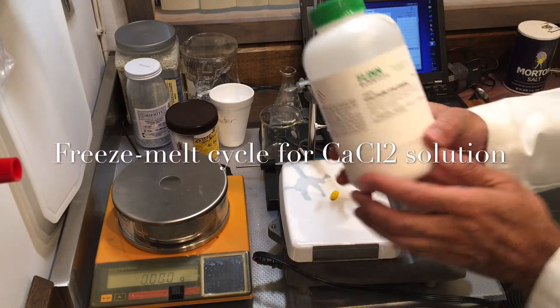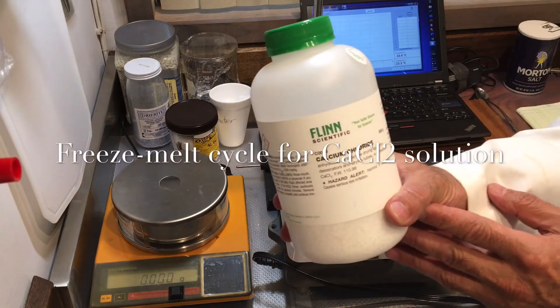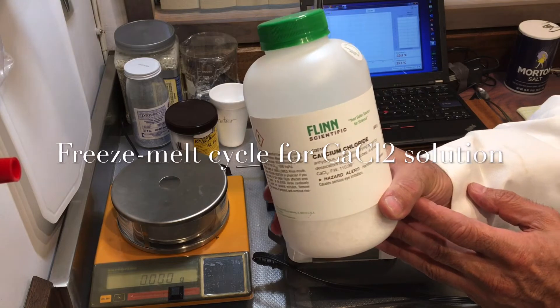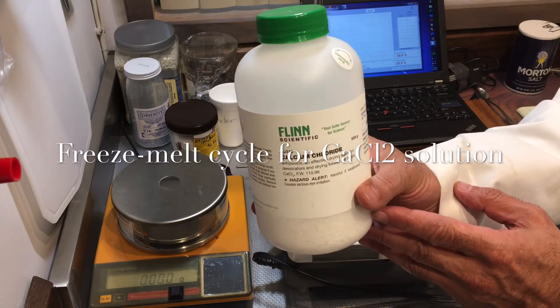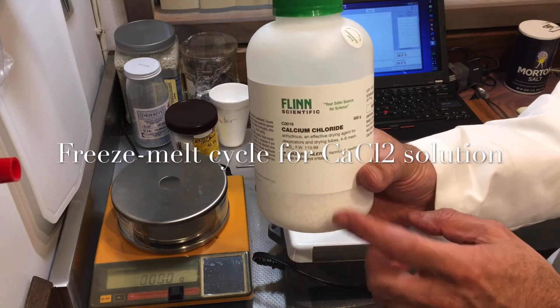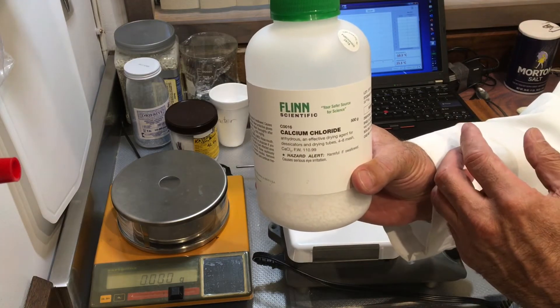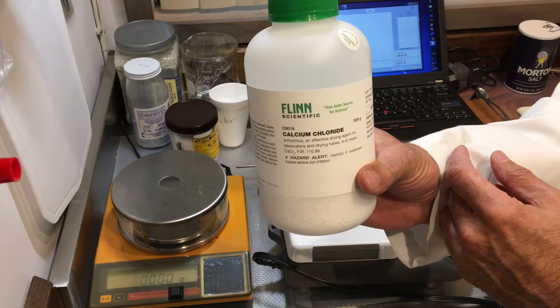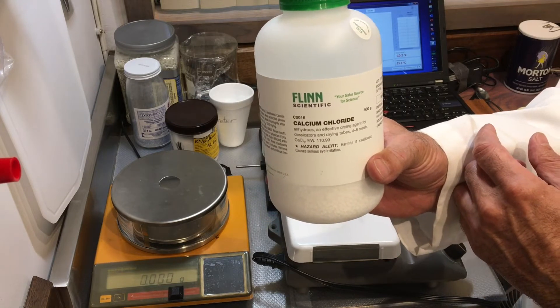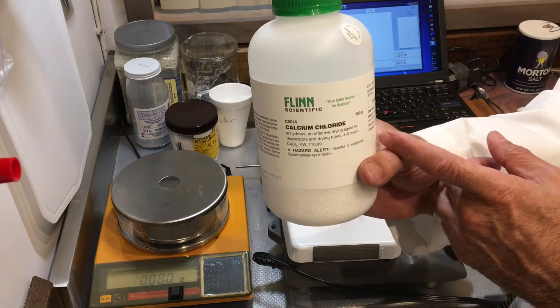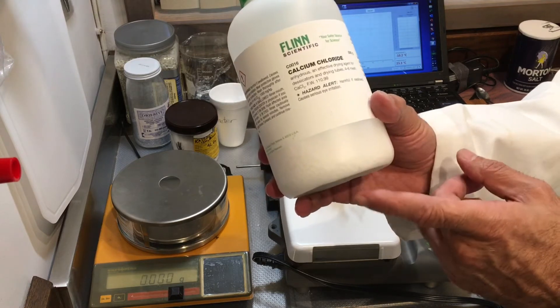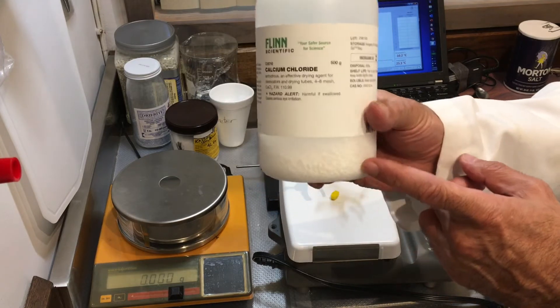Our next salt is calcium chloride. This salt is anhydrous, which means it doesn't contain any moisture water as water of hydration. It's pure salt of CaCl2. It's also used as a desiccant, which is a drying agent. It's like coarse crystals like that.